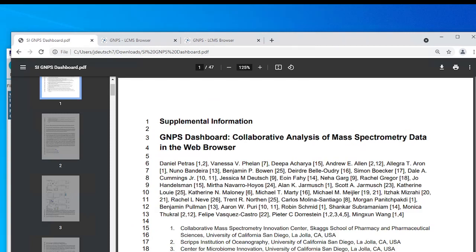This example has shown how to use the LCMS dashboard to generate an XIC on a chemical formula. Additionally, we compared XICs of multiple files, including analytical standards and bacterial isolates. I hope this use case will aid you in your data analysis.